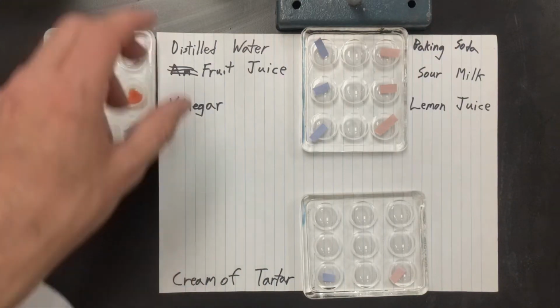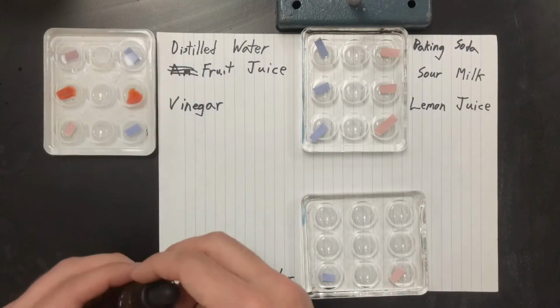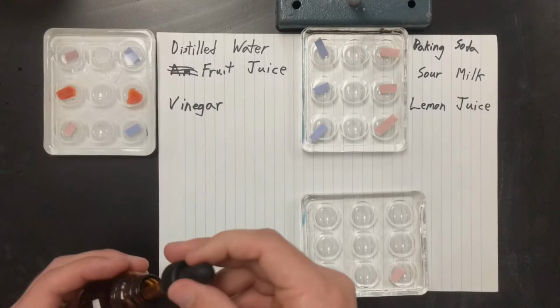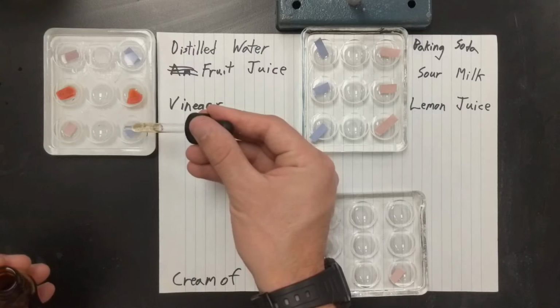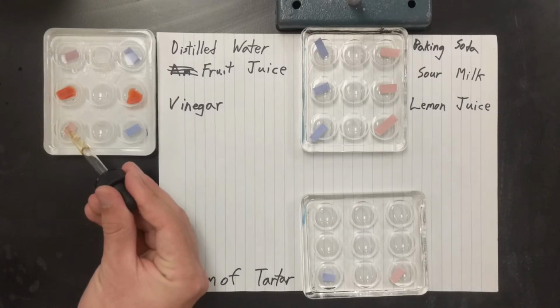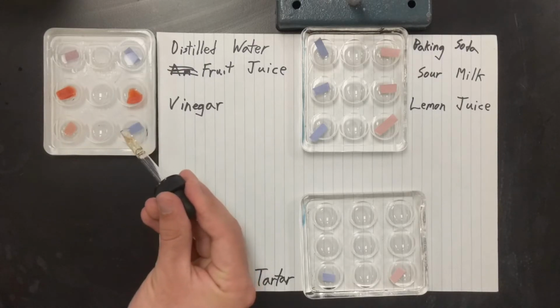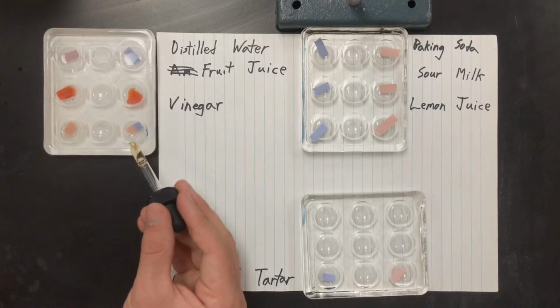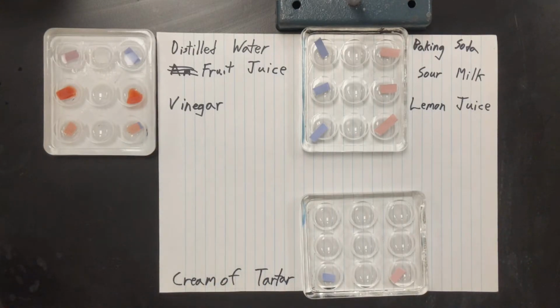Looking at the next one, we have vinegar. So here's our vinegar. Going to take some up into our eyedropper, put 2 drops. Let's put on the red first. 1, 2, so no change. And onto the blue. 1, oh, you can see it, even 1 drop. And 2. And you can see it changing before your very eyes.